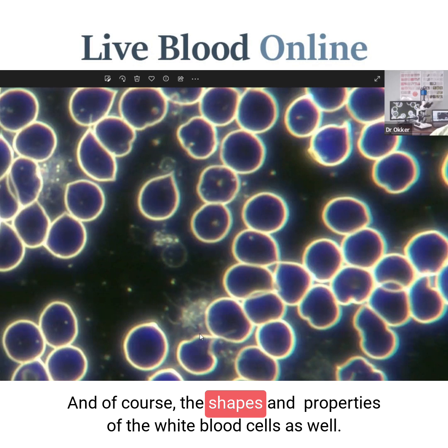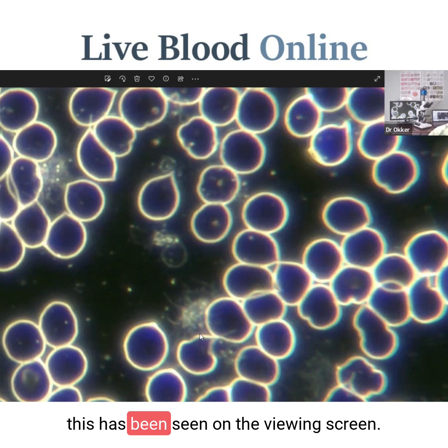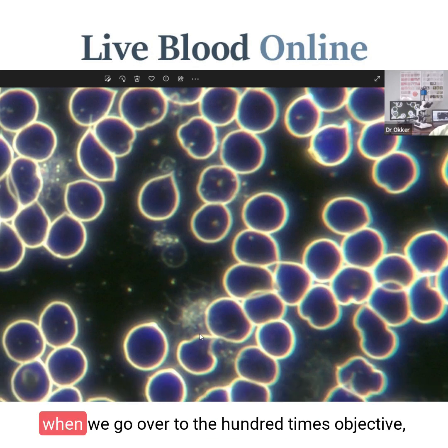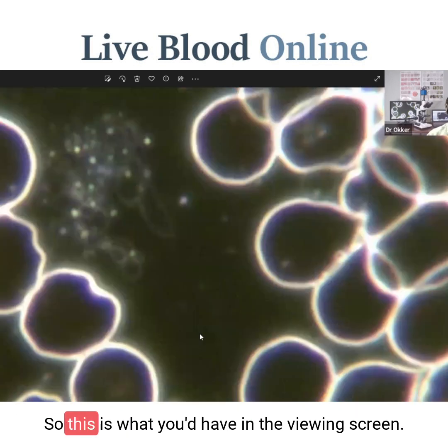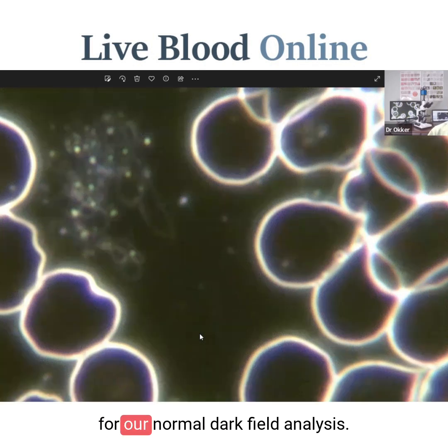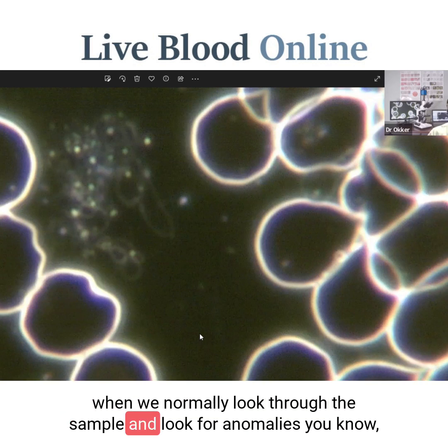We can also see the shapes and properties of the white blood cells. The benefit with our system is that this high level of magnification is seen on the viewing screen — the screen showing the blood sample to the client will produce this level of magnification with a 40 times objective. When we go over to the 100 times objective, we get a magnification of about 4,000 times. You can see the size of the red blood cells really quite large, though the magnification is actually a little impractical for our normal dark field analysis — it's a little too magnified when normally looking through the sample for anomalies.